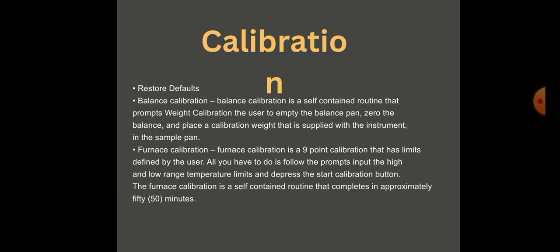Calibration. Balance calibration is a self-contained routine that prompts the user to empty the balance pan, zero the balance, and then place the calibration weight that is supplied with the instrument in the sample pan.